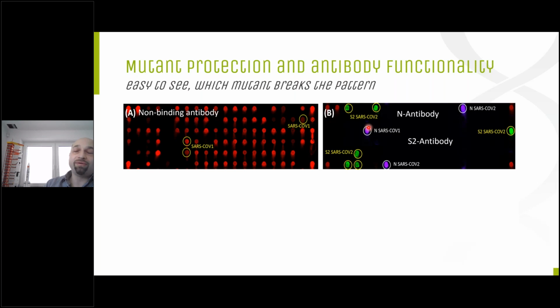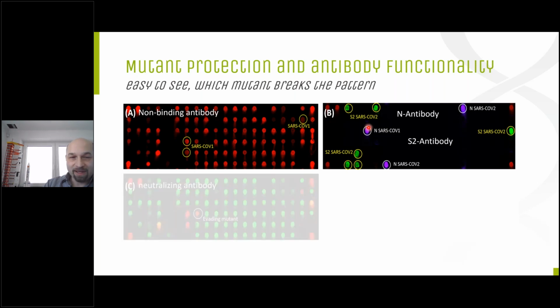You see already here cross-reactivities and can deduce from the kinetics also the binding constants and the binding rates. So this is really a broadband analytical platform with these arrays. And always remember, this is only 1/3 of the whole array. So there is a lot more data which you have in the backend. And to each data point here, to each image, you have a complete binding curve of all the steps of all the bindings.